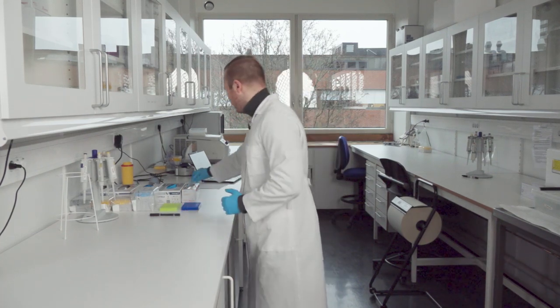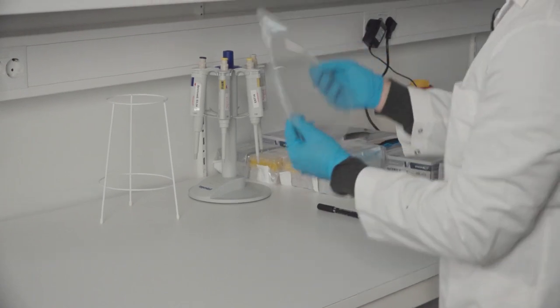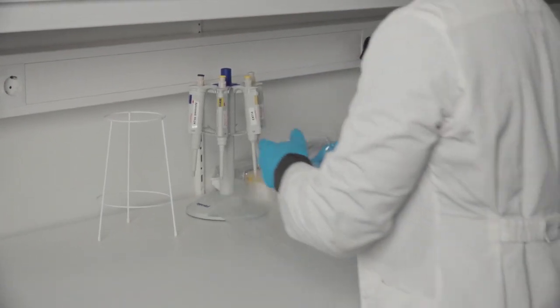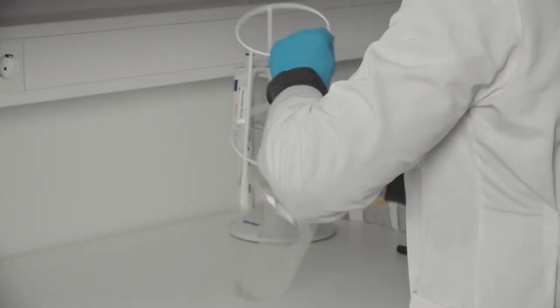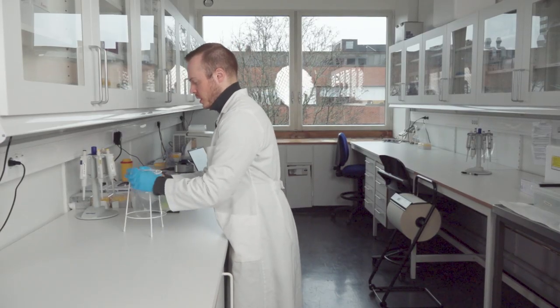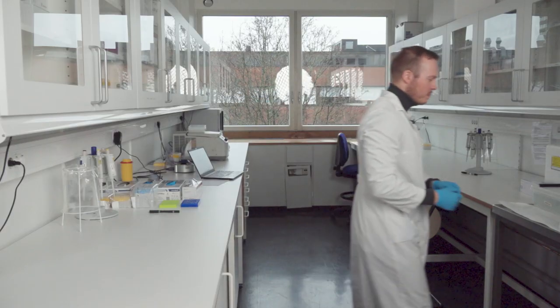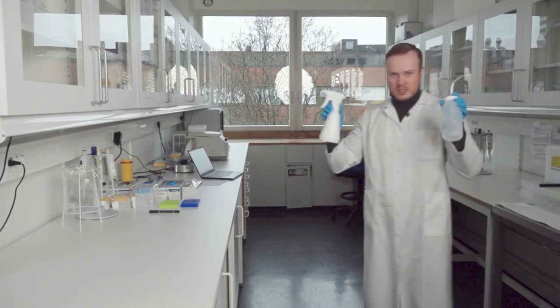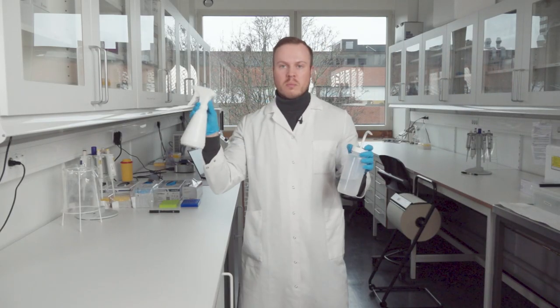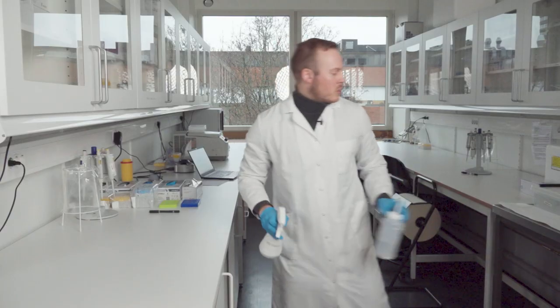We get a plastic bag that will contain our trash. Trash management is also very important when working in the lab — keep it tidy and clean up after yourself.